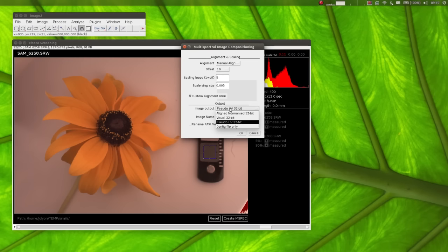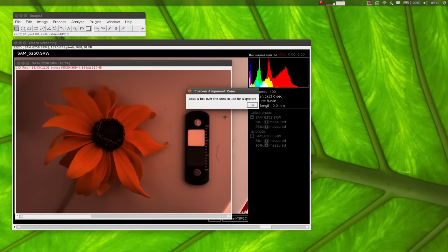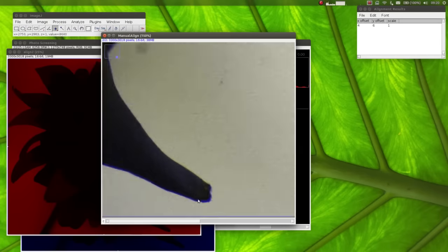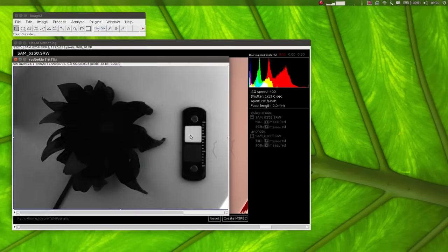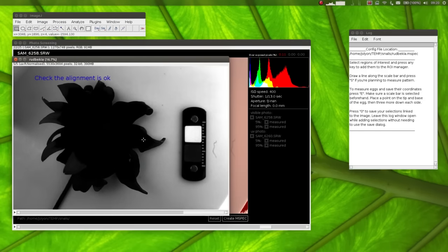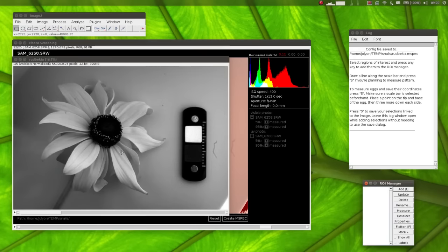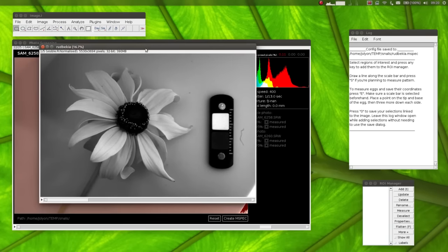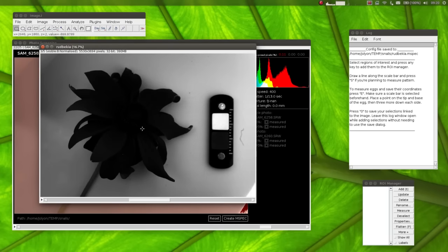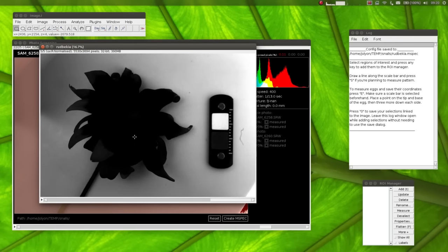and again I'll just keep all these settings. I'll show it in aligned normalized 32-bit. And check the alignment looks okay. It looks very dark, but from the silhouette you can tell it's quite well aligned. Now you can see there's lots of red, a fair bit of green, but very little blue and very little UV.